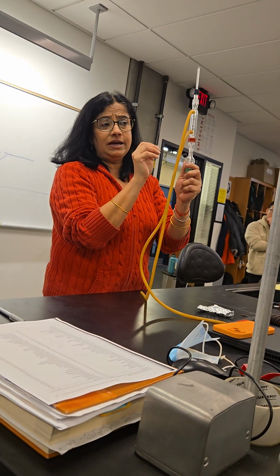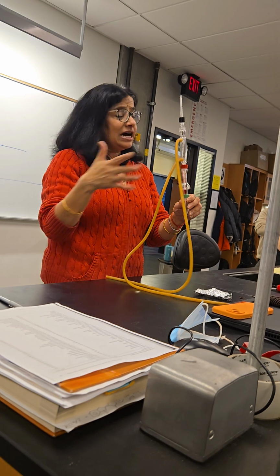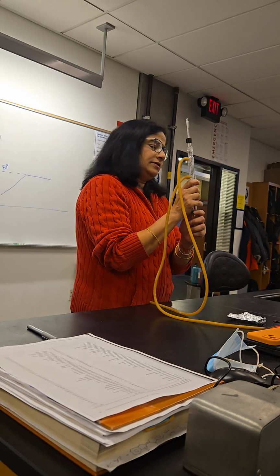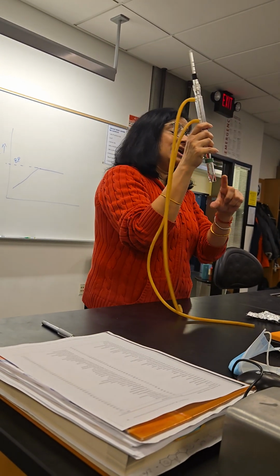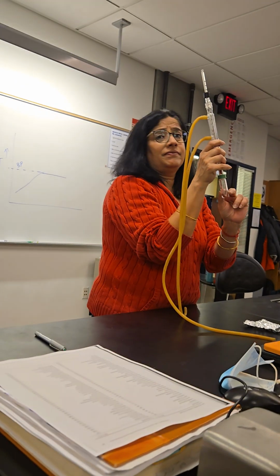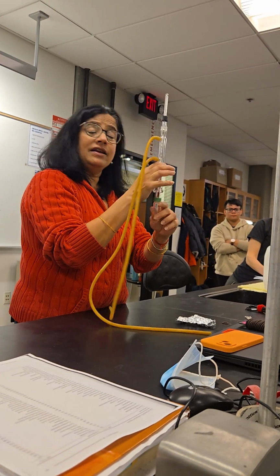Make sense, everybody? But when do you turn off the heat? When do you say your distillation is done? So the rule number 1 for distillation is never ever evaporate to dryness. That's not safe. Which means that you must keep an eye on it, and you must leave a tiny quantity of the liquid behind. So never dry it completely. So leave a tiny quantity. And at that point, we turn it off. And then turn off the heat.